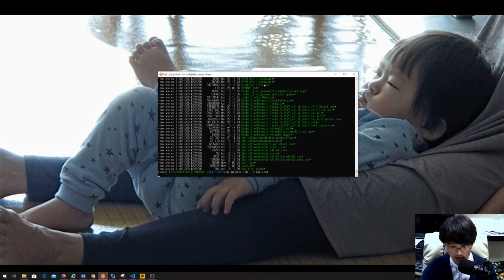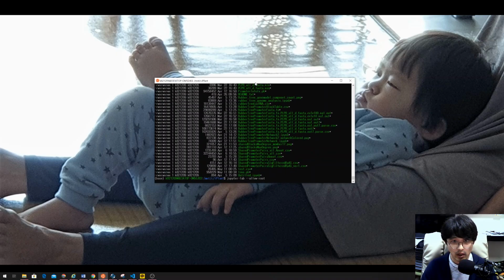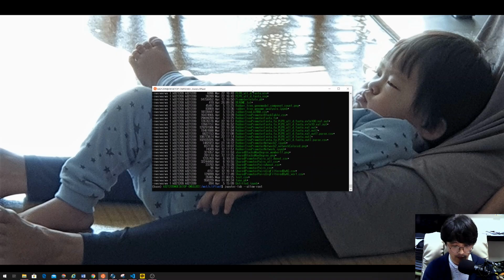So last week we created the network of Arabidopsis thaliana using fixed strings, which are extracted from the BLAST result.